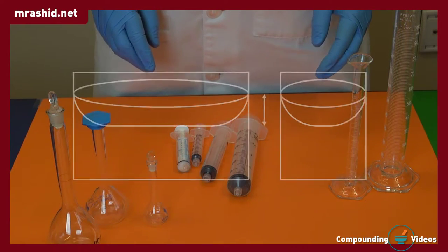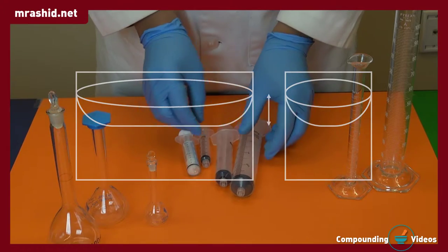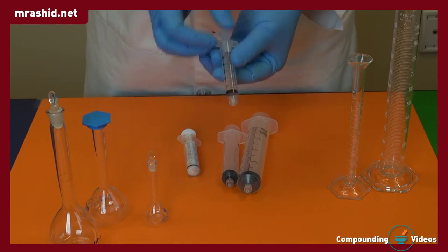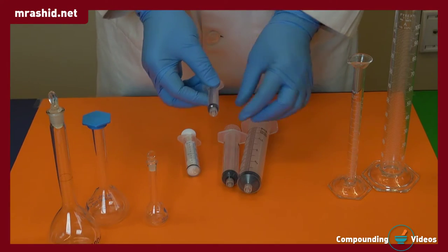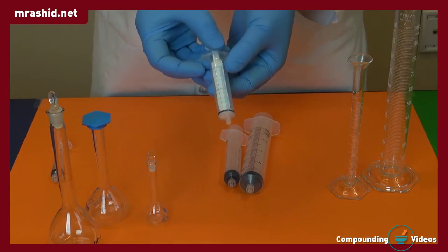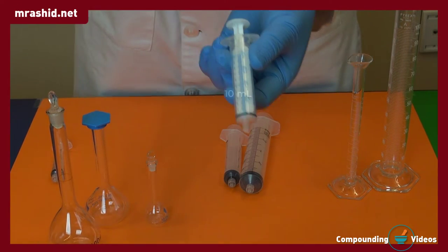Syringes may also be used for measuring liquid. This one is 5ml, which we cannot use for our desired 10ml of volume. This one is 10ml. Here are the graduation marks, and it can be used with precision.